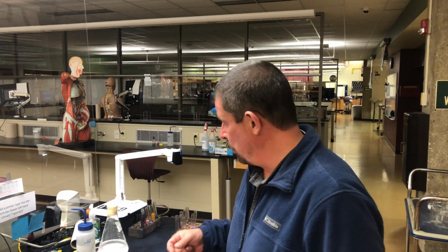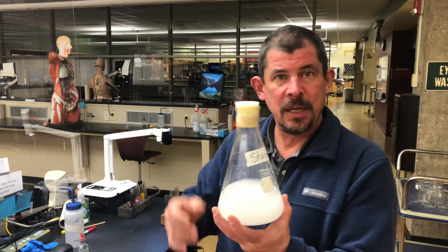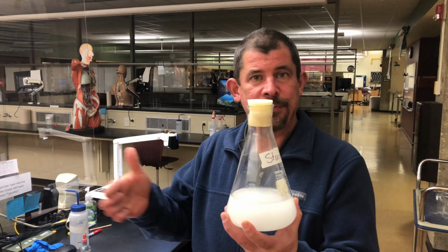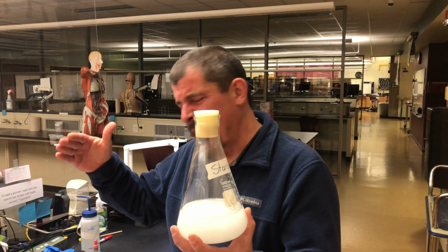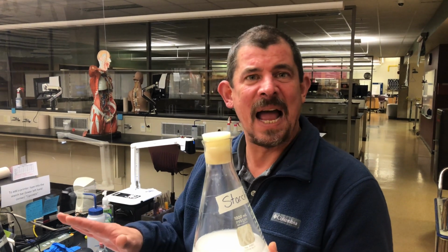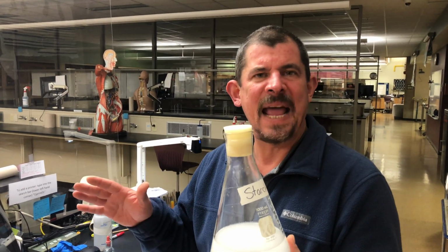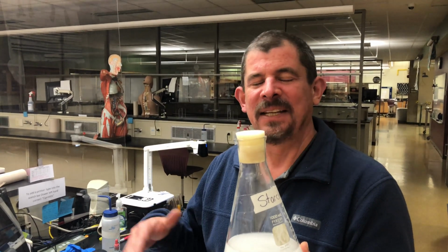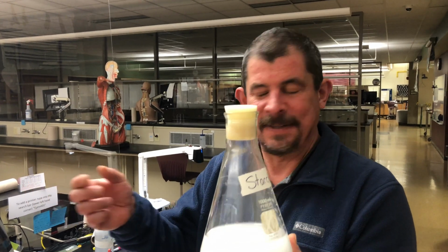What we use is this solution that we made up in lab. This is the starch solution. And then again, we would put equal amounts into 2 different test tubes. As you're reading underneath the preparation in your lab checklist, these would be test tubes 5 and 6. In test tube 5 is where we would add the pancreatin. And in test tube 6, we just have the starch solution without pancreatin.